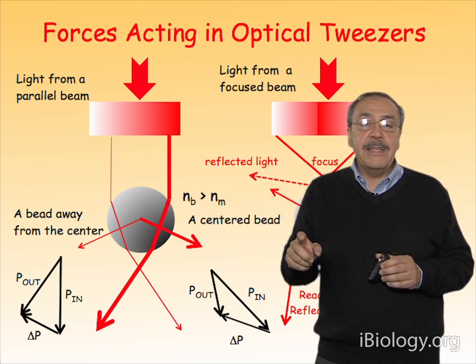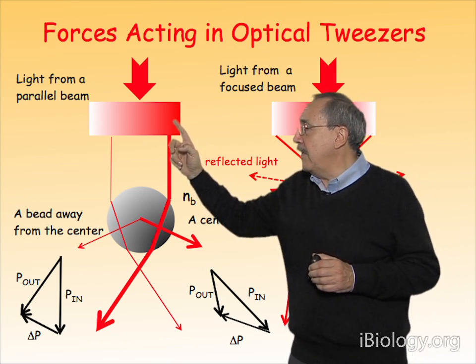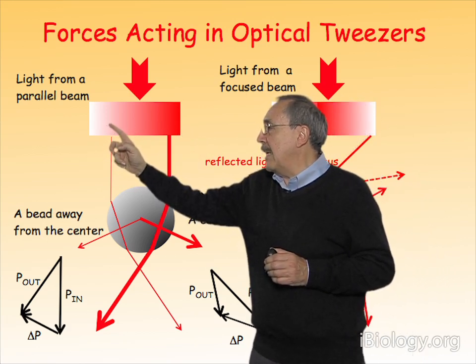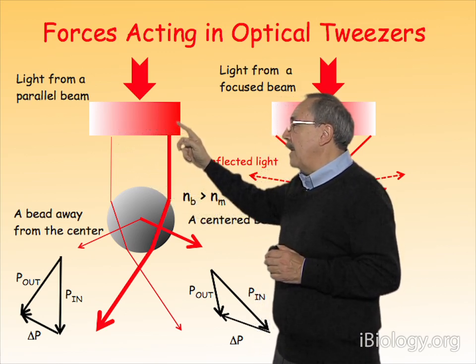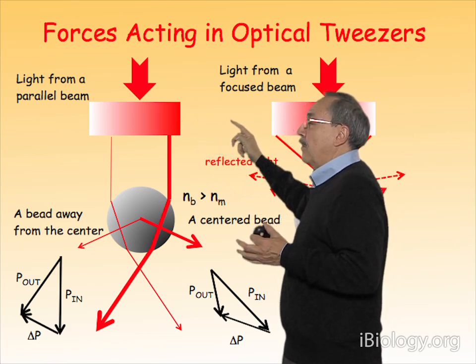Now imagine that the center of the beam is up here. This is the profile of intensity of the beam. Notice there is not much light coming on the periphery, but as you get towards the center the beam becomes more and more intense, and then presumably you can imagine that this continues symmetrically towards the other side.